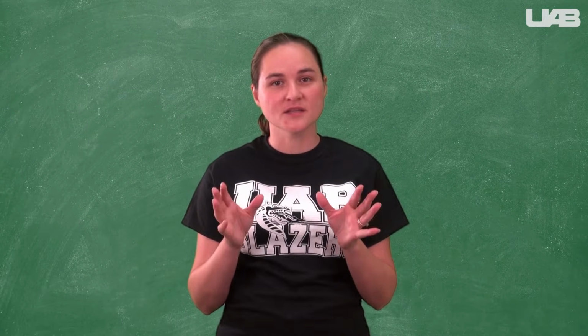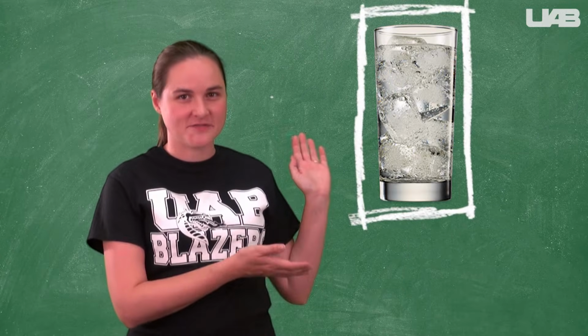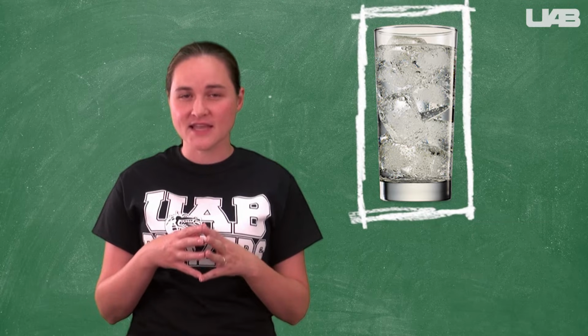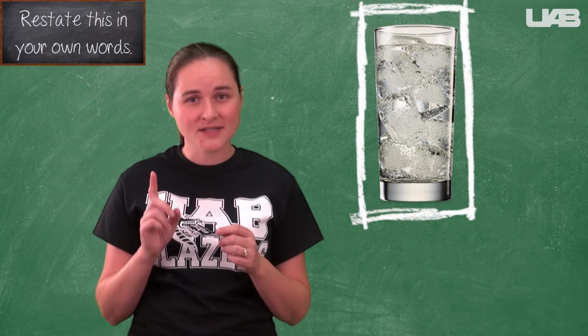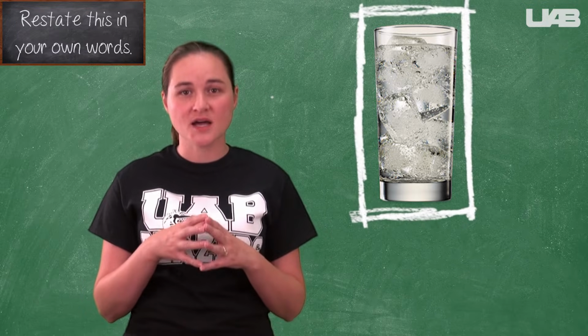We mentioned clear colorless solutions, so let's have ourselves a little chat. What color is this fine glass of soda? Students often answer clear. However, clear is not a color. Solutions like this can be described as colorless.